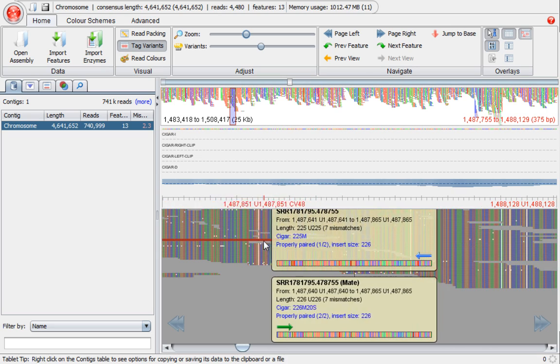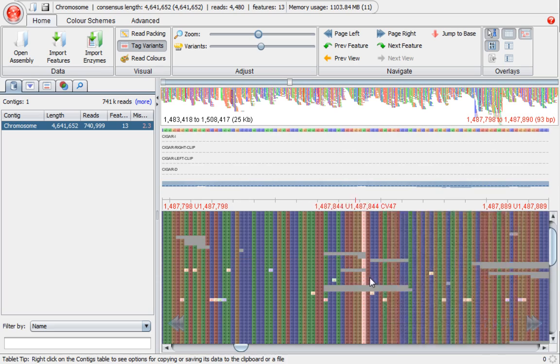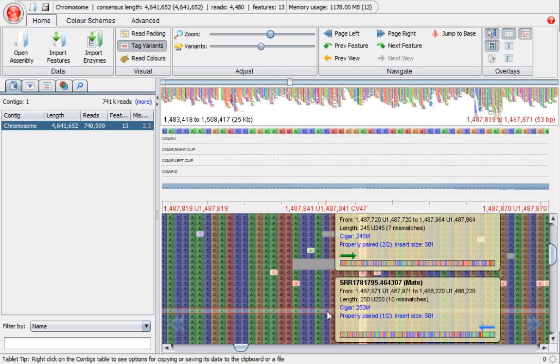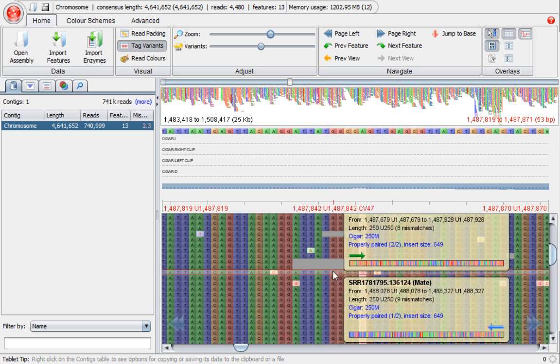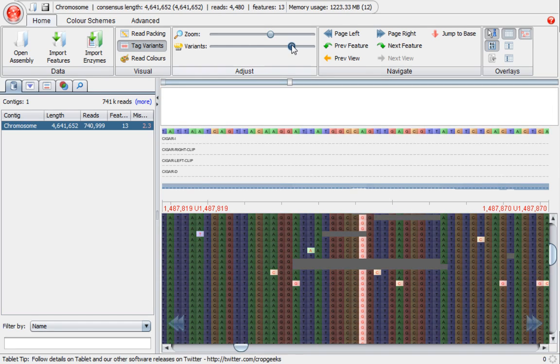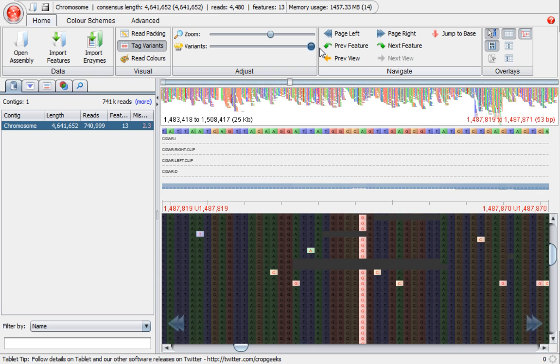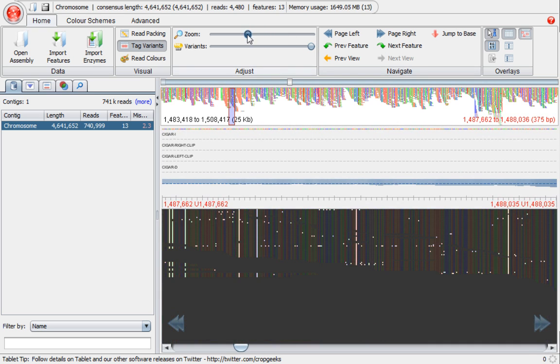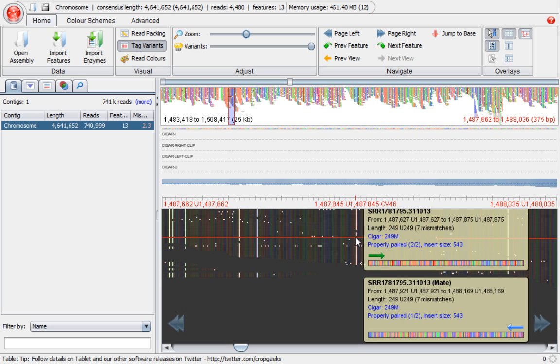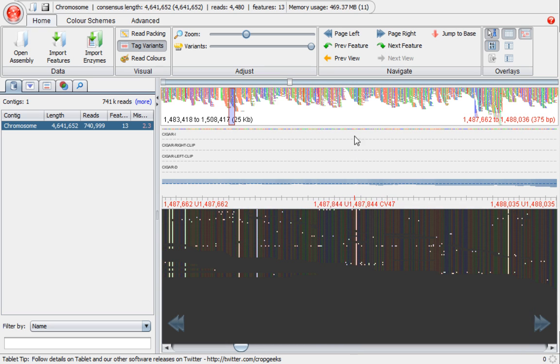Other things you can do, zoom in a bit more, interesting bit, let's just double click and it will zoom us in a little bit there. So we can do the variant highlighting with the variance. In fact, you can go to almost a completely sort of Manhattan at night view there, where just the key changes against the consensus are shown.